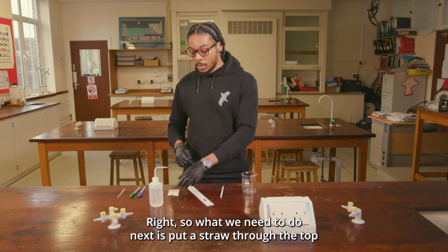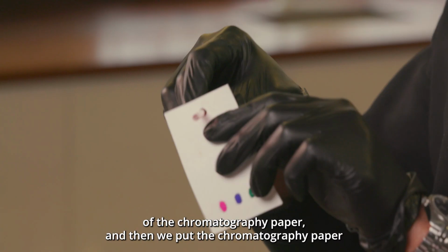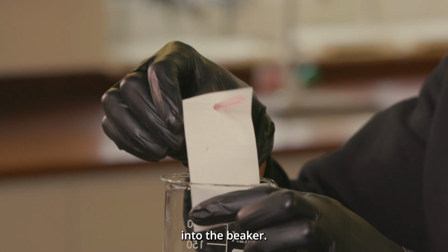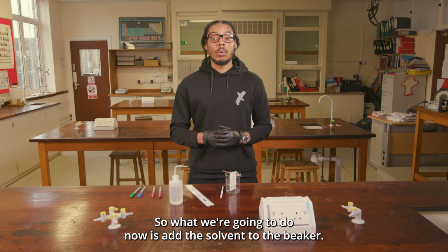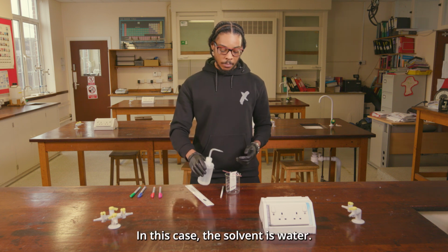Right, so what we need to do next is put a straw through the top of the chromatography paper. And then we put the chromatography paper into the beaker. Right, so what we're going to do now is add the solvent to the beaker. In this case, the solvent is water.